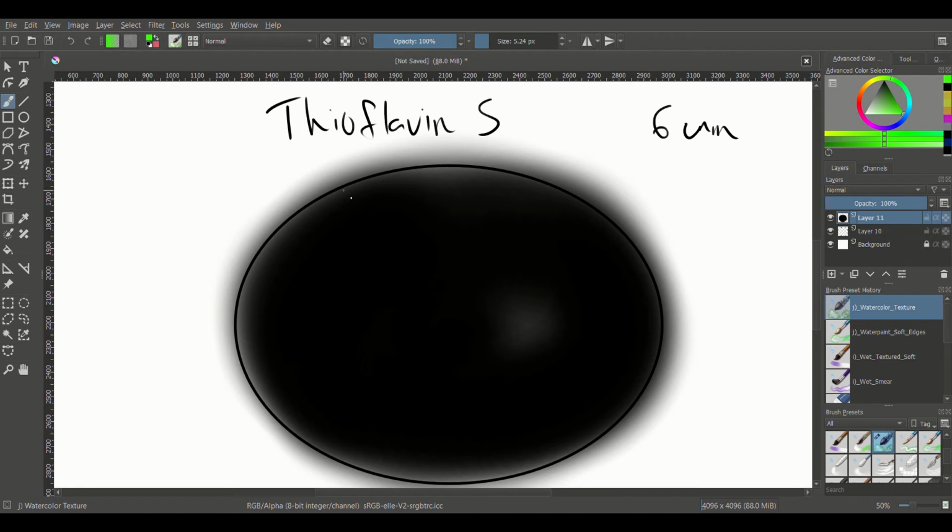Go through 95s and dehydrate down to xylene, and make sure you mount with something that's a non-fluorescent medium. And when it's all done, when you look at it under a fluorescent scope with a proper filter, all the neurofibrillary fibers are going to show up. So you're going to see a lot of these in the background.